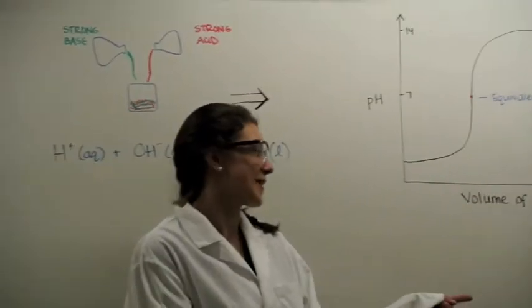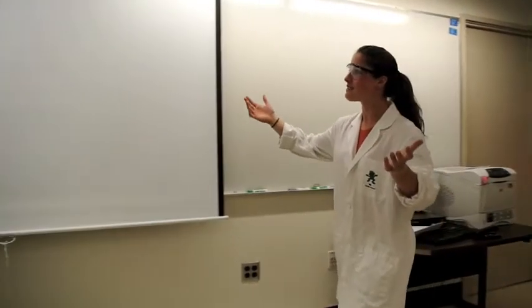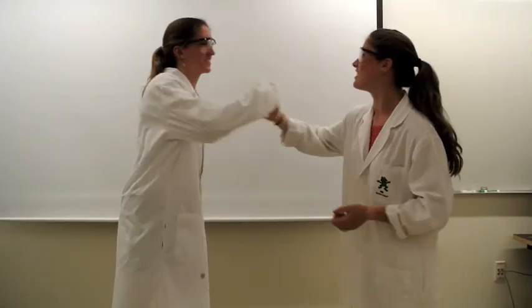And on to you, Autumn and Kestrel. Yo, Kestrel, what's up? What's up? Ready to do some titrations? Yeah, I love to drop the base. You ready? Ready. How about you?